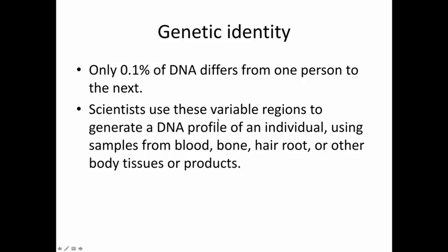As long as that hair is not naturally shed, it pulls out the follicle. You have some genomic material from that hair that you can then put through this short tandem repeat process and generate a DNA profile of an individual.